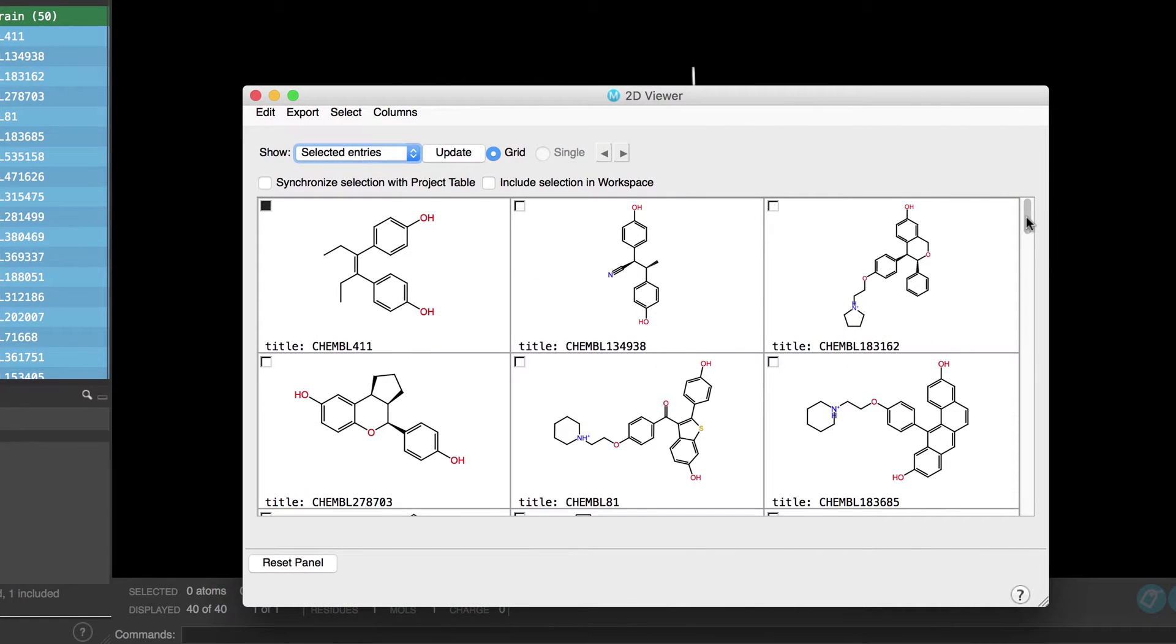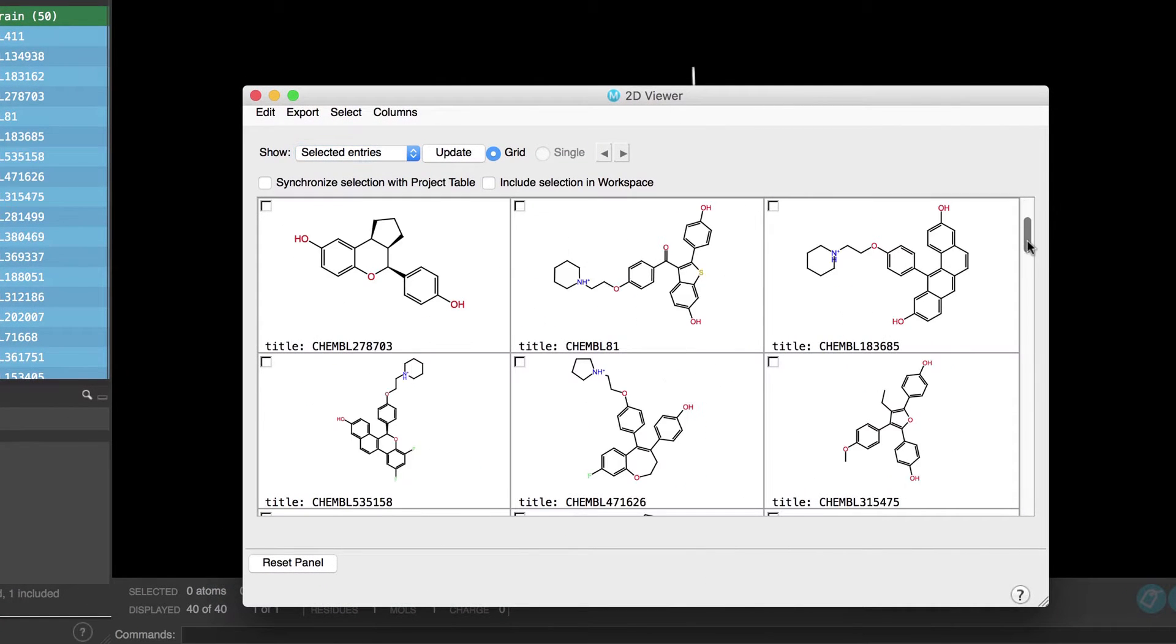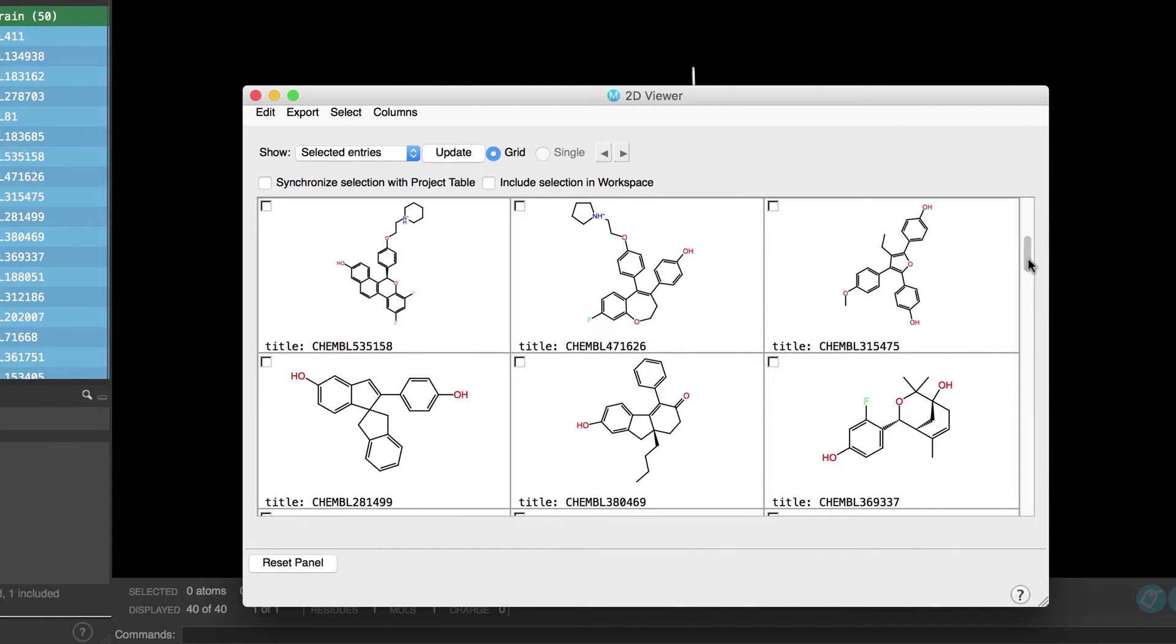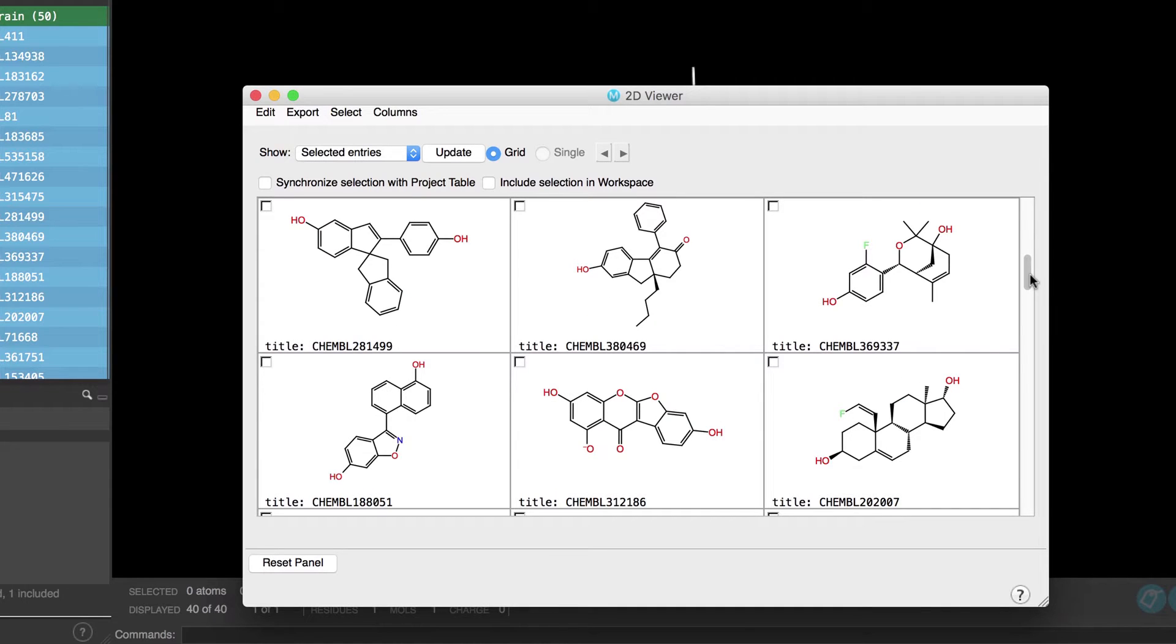Simply note the diversity of these ligands and the lack of obvious congeneric series.